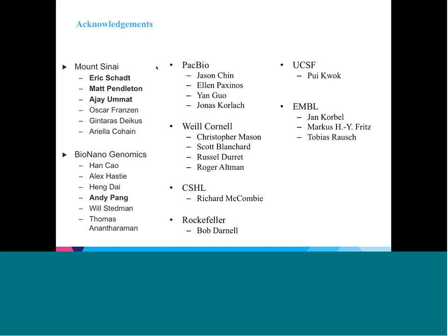Terrific. Thank you. The next question is, have you tried any wet experiments to validate the structural variant results? Yeah, so we've done some targeted PacBio sequencing, and obviously we could run some long-range PCR or Sanger-type experiments for validation. So we didn't end up including that that I know of. Ali can probably comment.